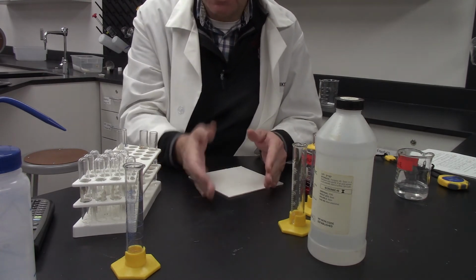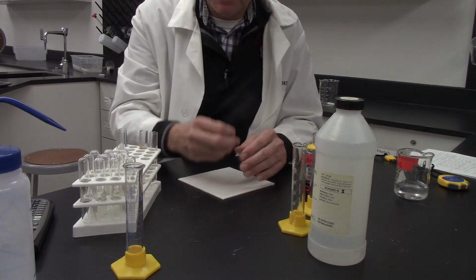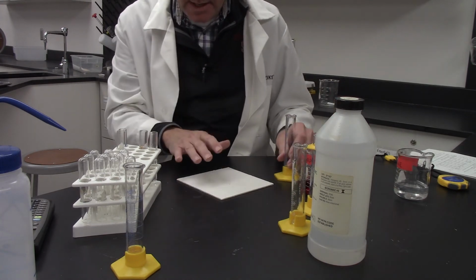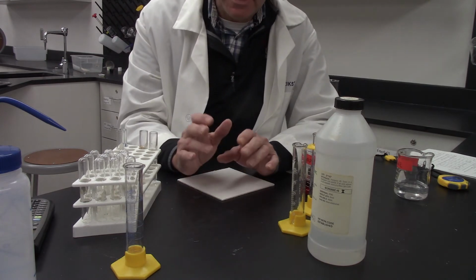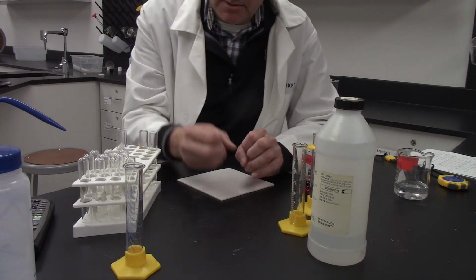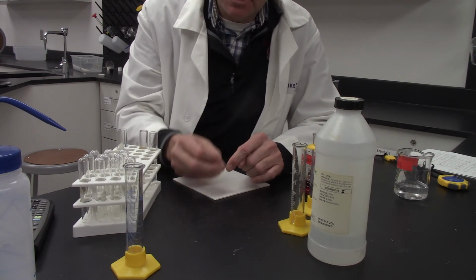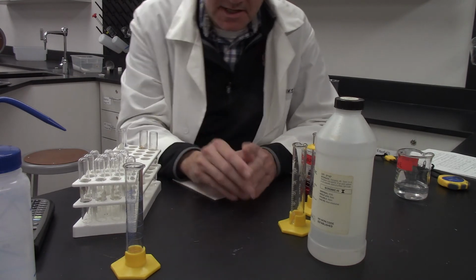Based upon a calculation of rate, we're going to determine how long it's going to take. We're going to have different concentrations of acetone, hydrochloric acid, and iodine, and we're going to predict. At that point, we're going to know our k values, we can calculate the rate, and then we're going to predict how long it should take for the reaction to take place. Then I'm going to run that, and then I'll give you that data.